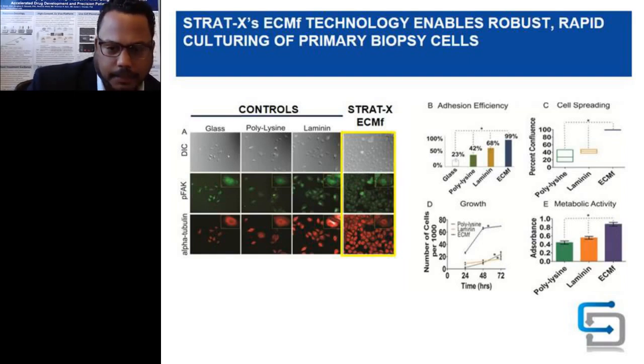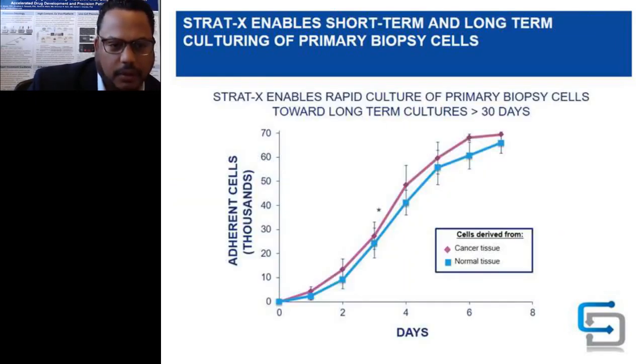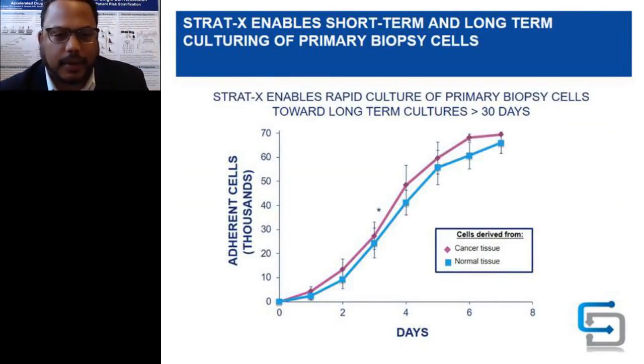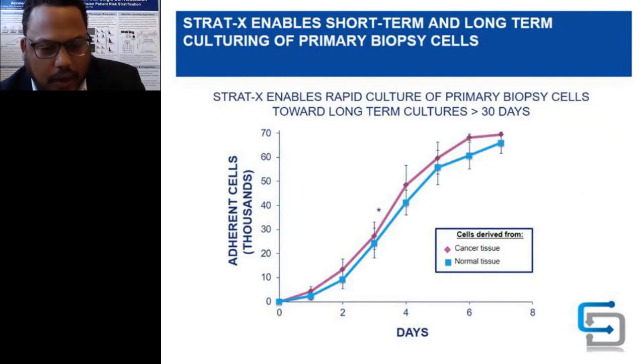And we've shown that this ECMF, or extracellular matrix formulation, can not only keep cells alive across multiple days, but even beyond, over the course of 30 days. We haven't tested beyond 30 days, but it's exciting to know that we can rapidly culture these cells, and then they can survive for a relatively long period of time, at least in the context of the application of clinical diagnostics and therapeutic development.